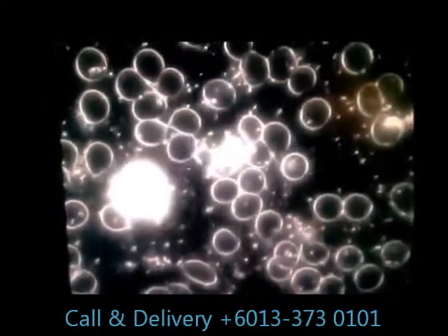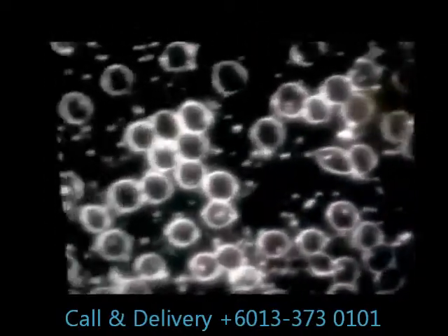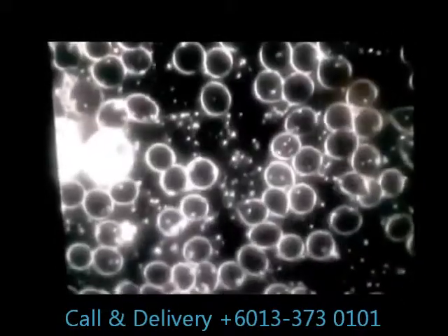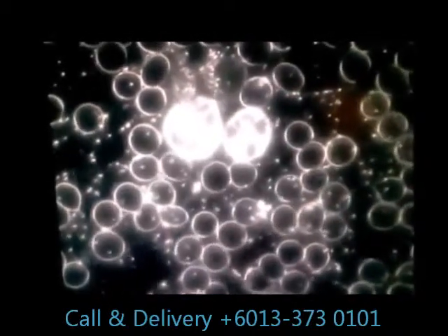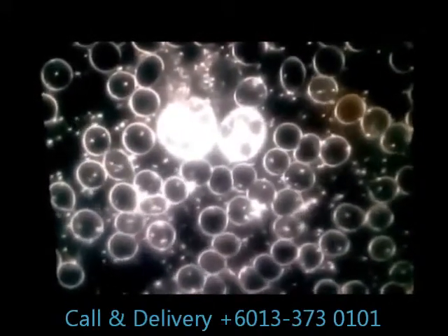Here we see a couple of white blood cells, maybe a little bit larger. You see several of them in one scan here. That lets me know that the immune system has been stimulated. See, here's two together. You see they have more shape, more form. The holes inside the white blood cell are normal. That's what we want to see.